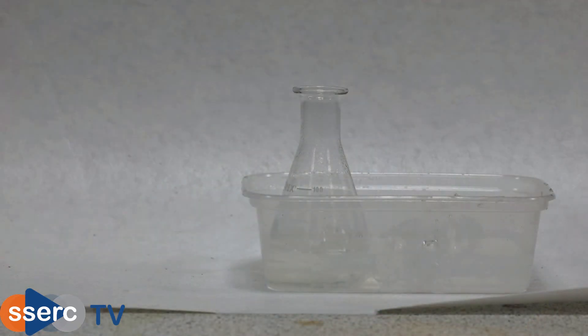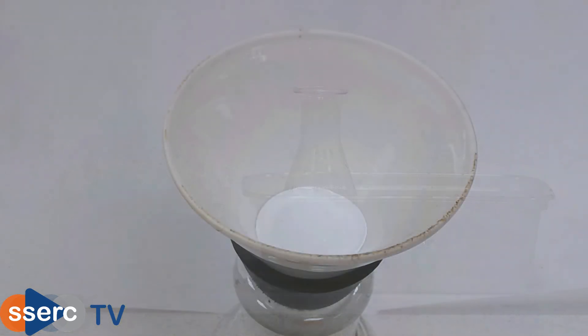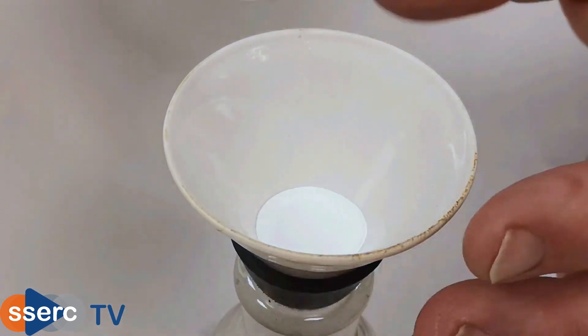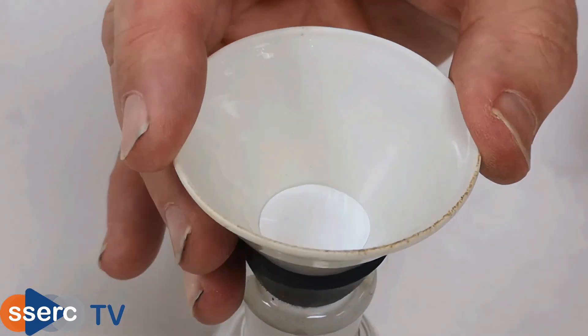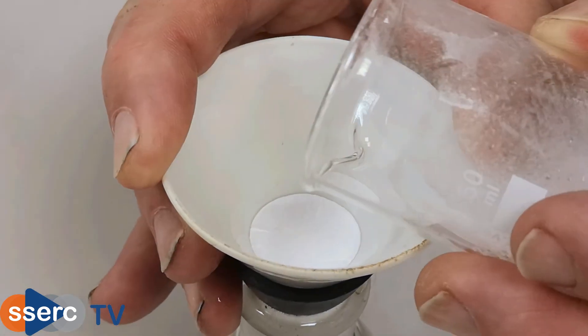Now we chill the solution to crystallize out the caffeine crystals. Once cold we then vacuum filter using a Buchner funnel or in this case a Hirsch funnel. The cold slurry of caffeine crystals is poured onto the filter paper and the solvent is sucked through by the vacuum.